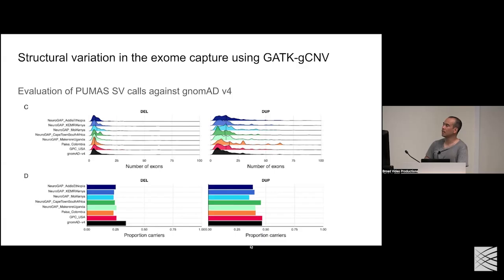We're roughly in the same range as we've seen before. So there are no real red flags that using BGE over the exome capture used before is going to hurt you in a meaningful way. You do have a little bit less sensitivity in those very small regions.